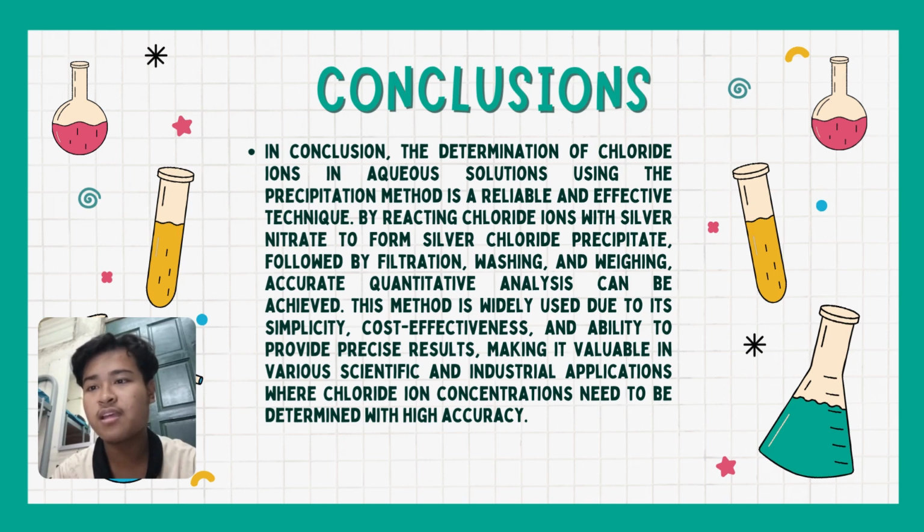And the last one, it is valuable in various scientific and industrial applications, where chloride ion concentration needs to be determined with high accuracy.